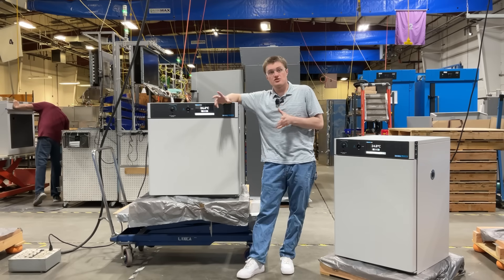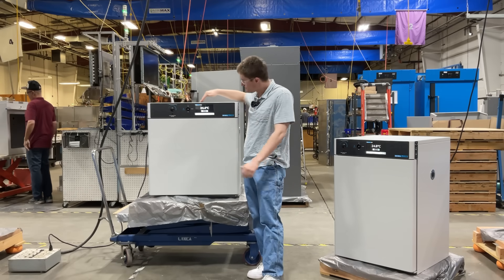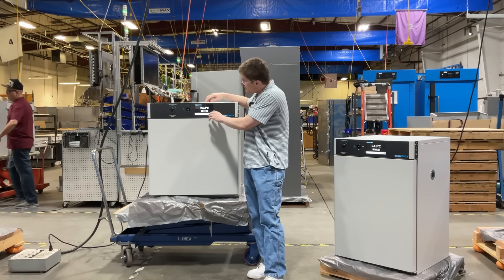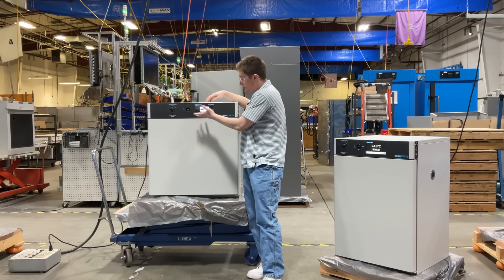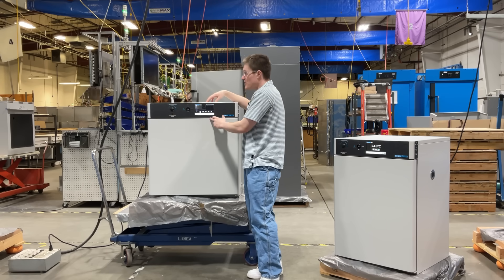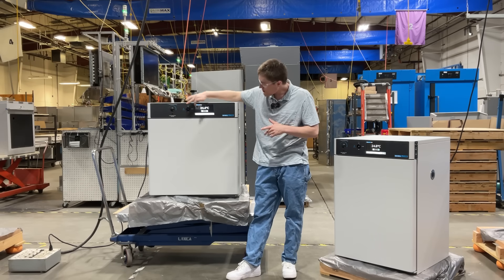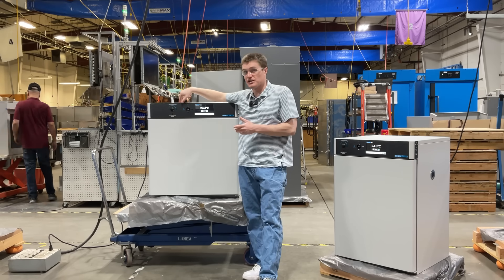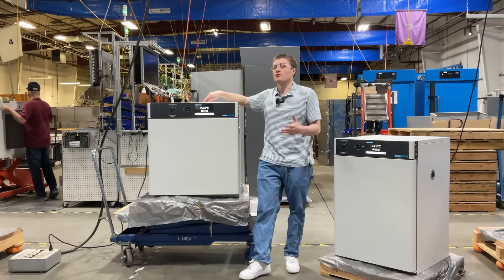These screens handle all essential functions of the unit outside of the OTL temperature limiter. These allow the user to monitor temperature, change temperature setpoint, and calibrate as they see fit. Additionally, data logging functions are handled by the control as well. The over-temperature limiter is a safety device that cuts off power to the heating elements, should an over-temperature or overheating event occur.